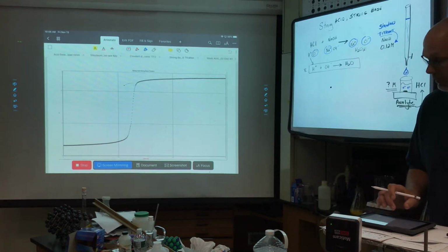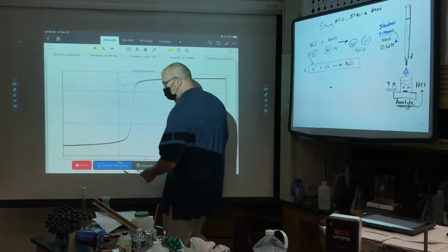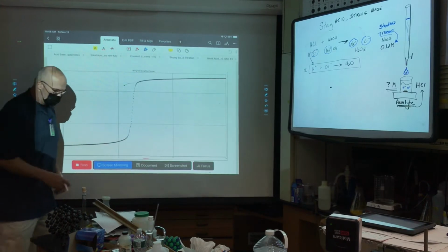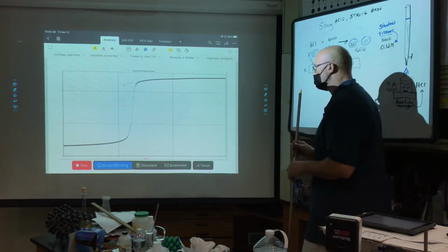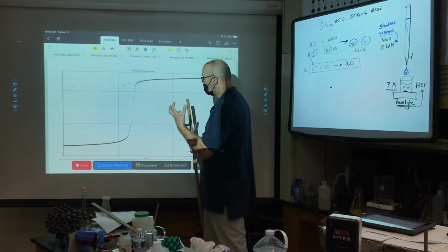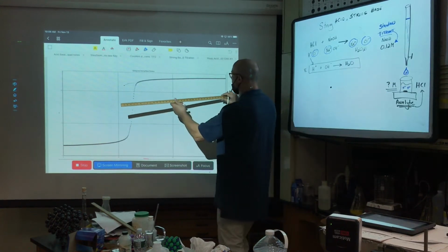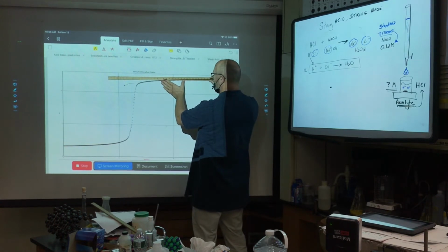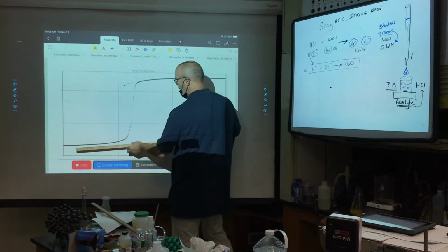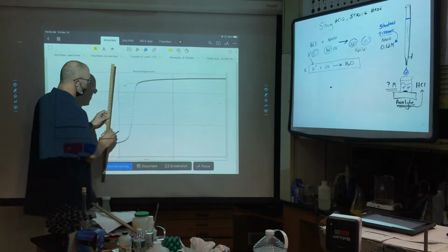Now, to do that, all right, the other day, the equivalence point in a titration is where all of the protons that were free protons or hydroniums in the beaker have now been matched with the hydroxides that were added. So what you do is you try to find where this starts to become exponential. Try to find that flat line. And you find this flat line down here, the best that you can. And then try to measure in between.